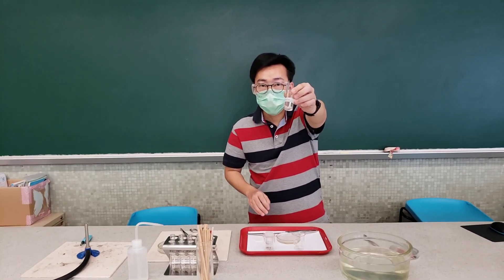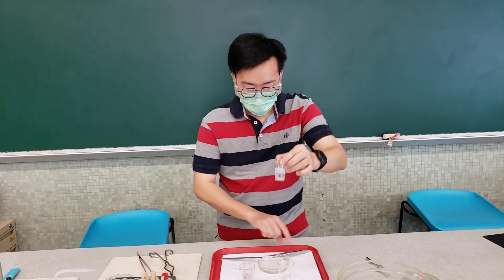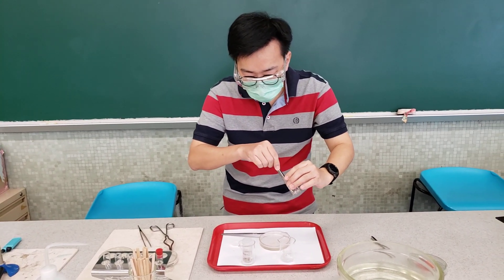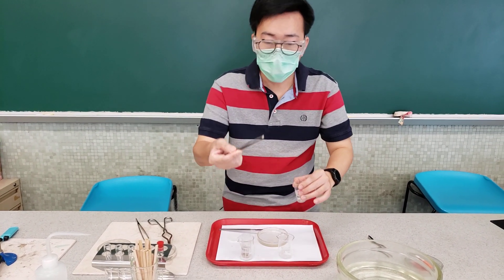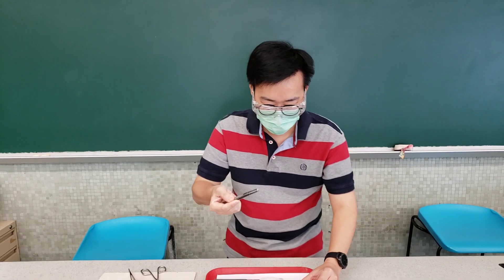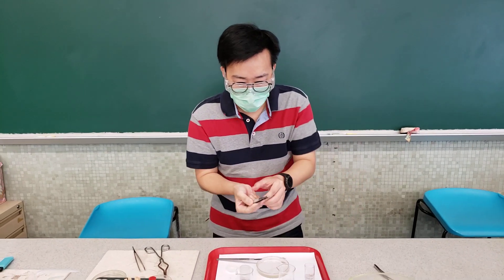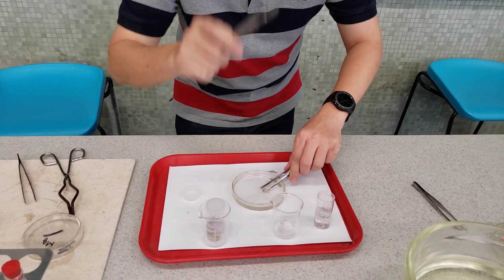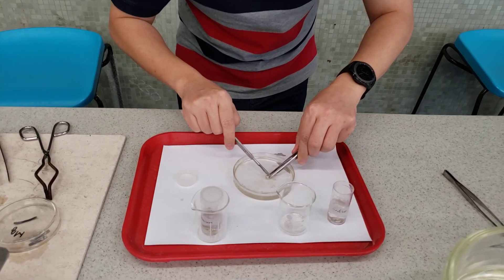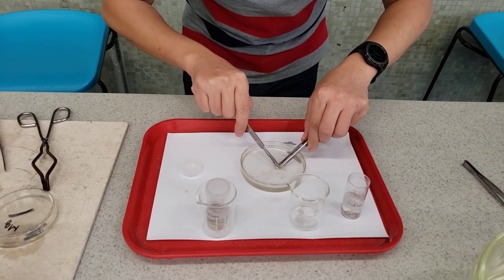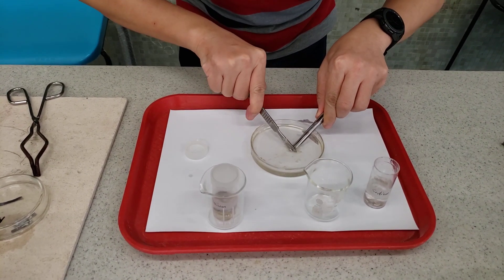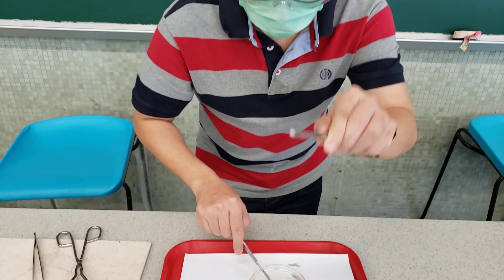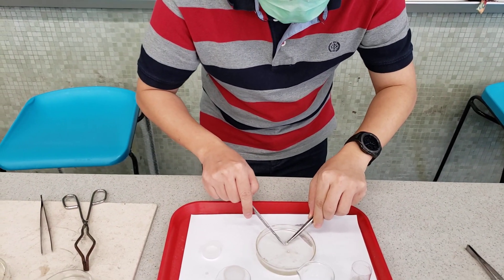Sodium. You see a piece of sodium? Now I try to cut it using a knife. You see? It can be cut so easily.